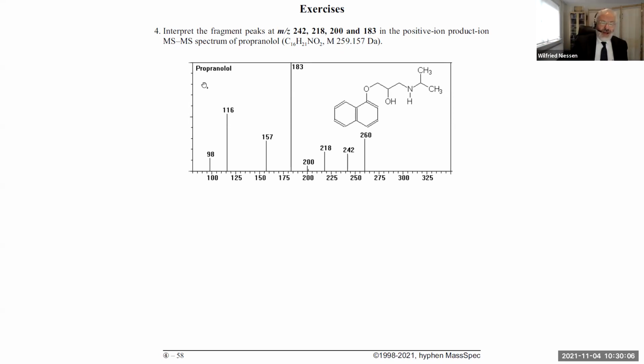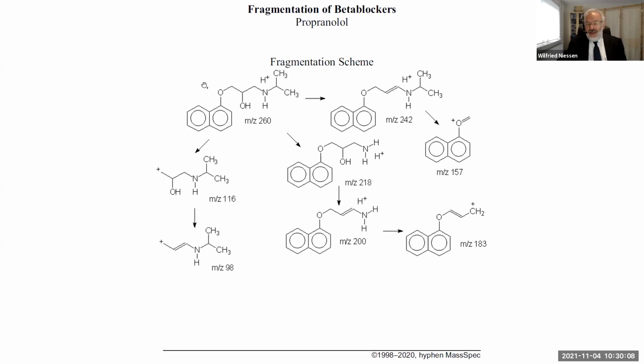Yeah, well, I will do so, because of the many people who worked on this exercise in these courses, you are the first, really the first, to notice the 201. And I like that, because I think the 201 is an important ion.